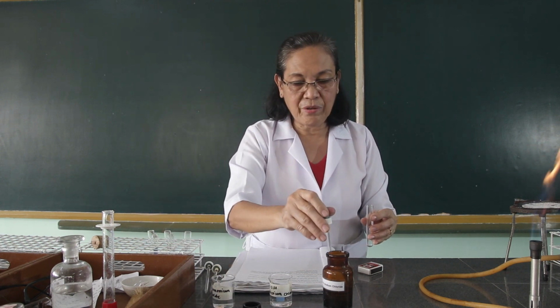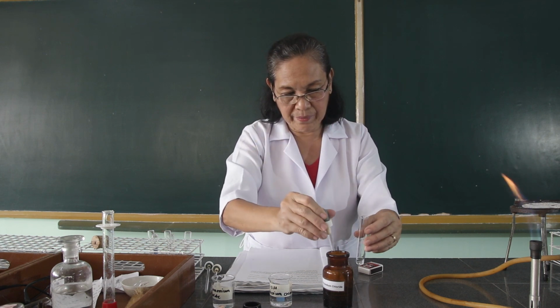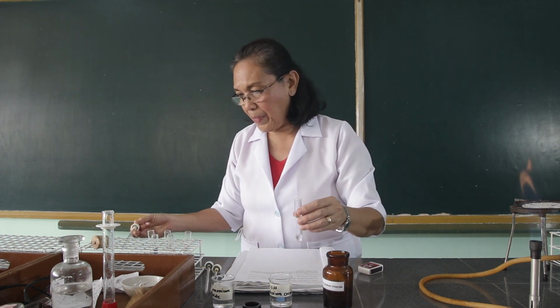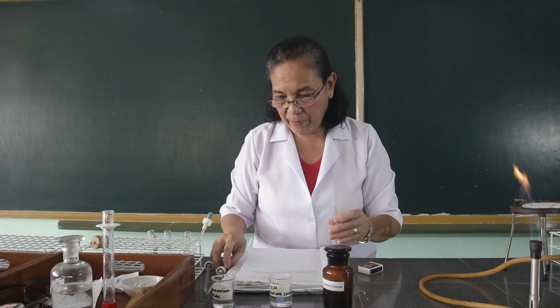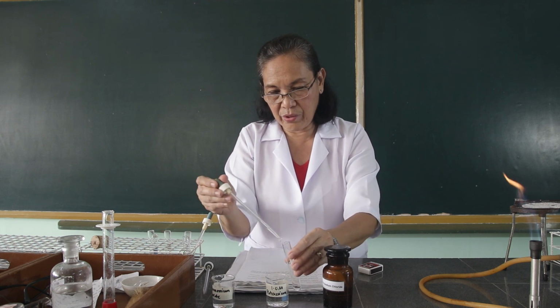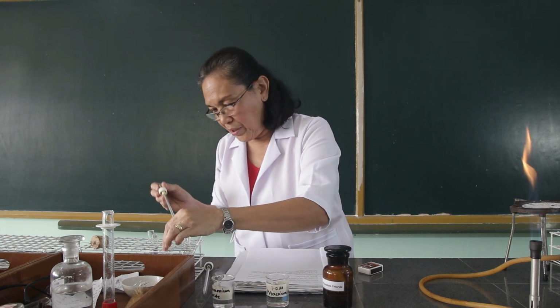So this is the sodium chloride solution. Let us use 1 ml of this. This is for sodium. This is the potassium chloride. Let's use 1 ml of this. So, potassium.